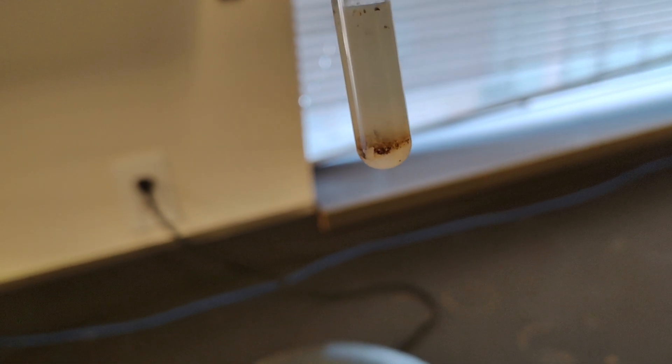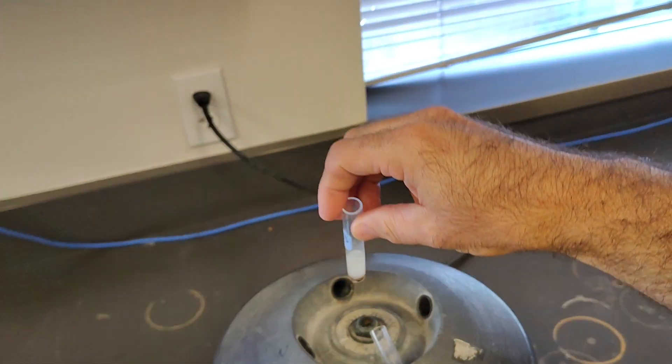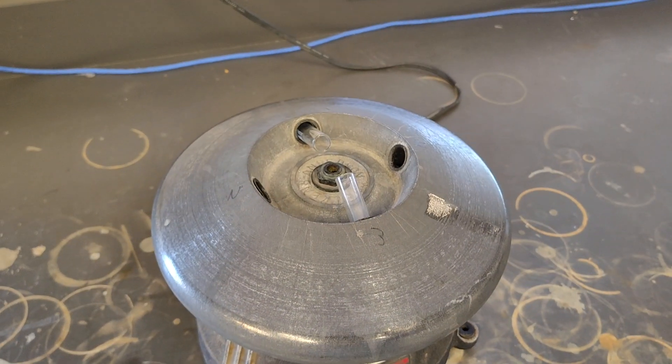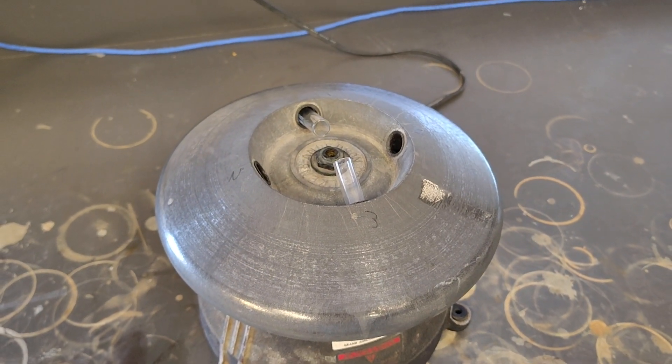To be honest, I would let this run a little bit more if I was doing an experiment. But for today that serves our purpose for the video. I hope you enjoyed learning what a centrifuge is.